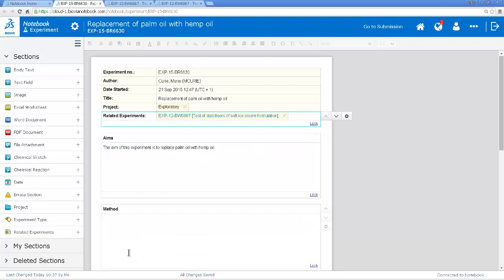So you can see in this simple example of one of the features of the BIOVIA notebook, you can search and find experimental information very easily. And then you can take that and you can reuse it. In this case I took an Excel sheet, put it into my new experiment and modified as I needed it. An example of how you can save time using the BIOVIA notebook.